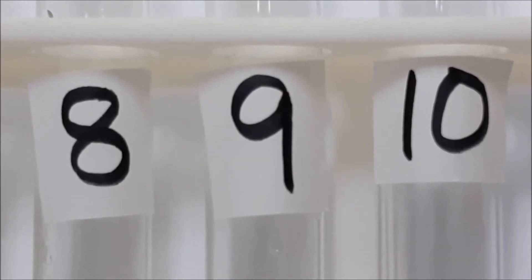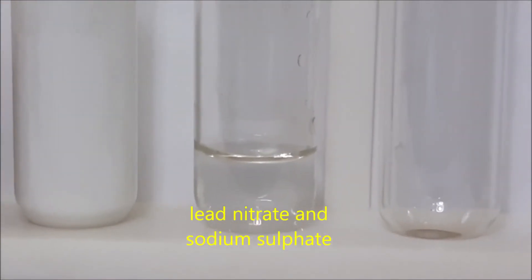For test tube number nine, we have lead nitrate and sodium sulfate.